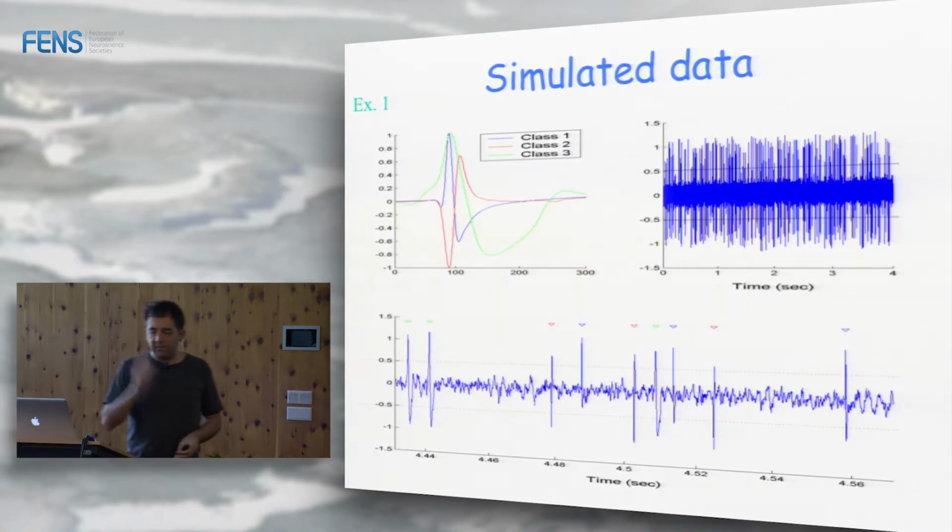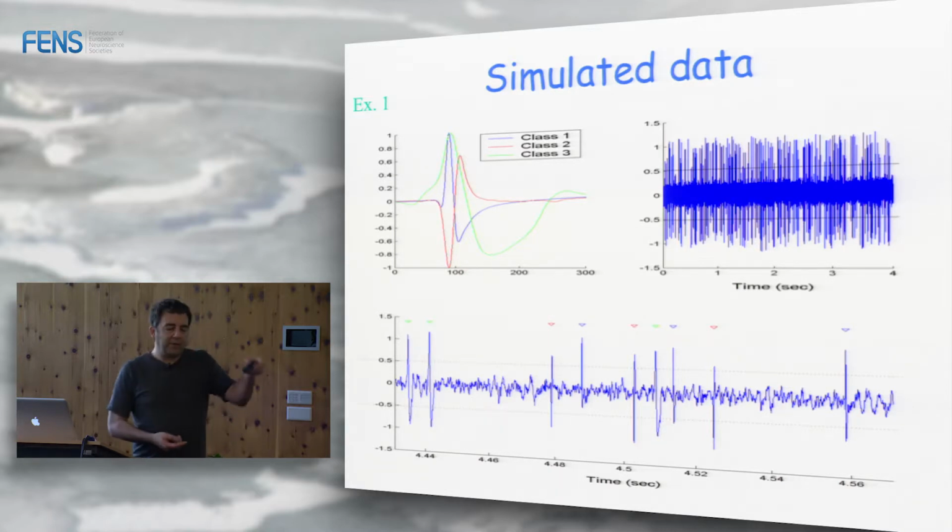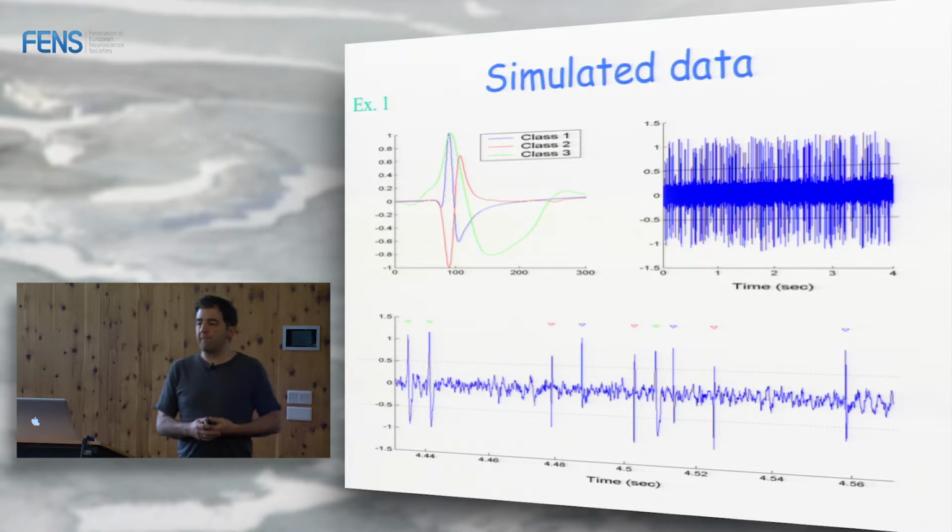So before that, there's a big problem, and that's related to your question. How can we test a spike sorting algorithm, right? Imagine that I come with my best ideas, and I put them together, and I come with my spike sorter, and I say, this is much better than anything else. Well, how do I know that? If I get a real recording, Simon has his spike sorter, and he says, well, from this recording I can get 3 neurons. And then I say, well, actually from the same recording I use mine, which is much better, and I can get 20.